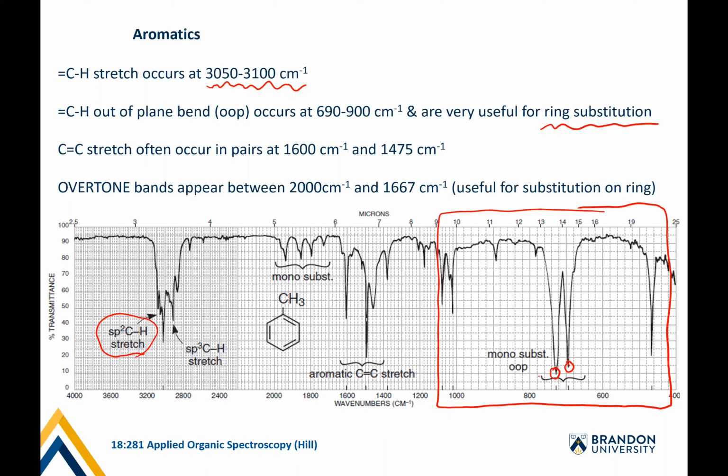We've got the carbon-carbon double bonds, like the aromatic carbon-carbon bonds. There's a pair of vibrations, one at 1600 and one at around 1475. So we'll see these here in the spectrum.